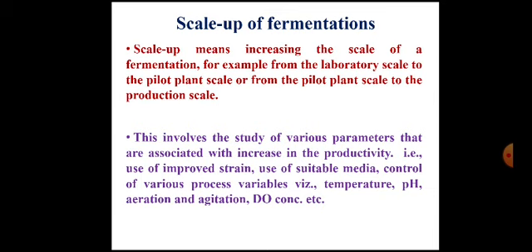So these parameters should be studied in detail at small scale, and then the detailed data obtained from the study of these parameters at small scale will be used for the operation of the next level fermenter. That is called scale up of fermentation. Therefore, the optimization studies are carried out at several levels to avoid the loss of process.